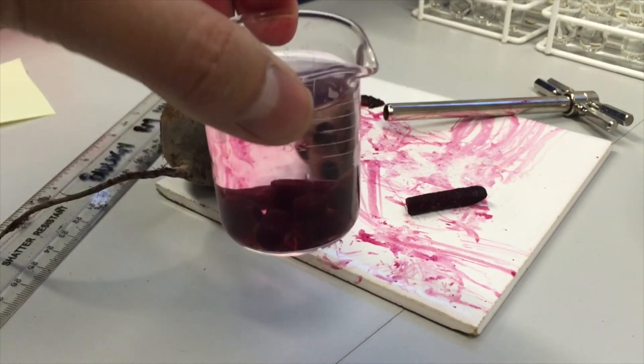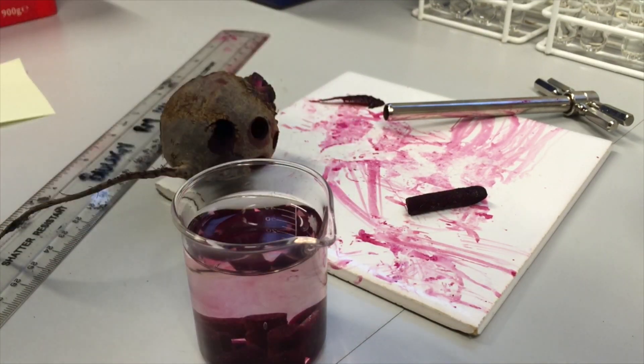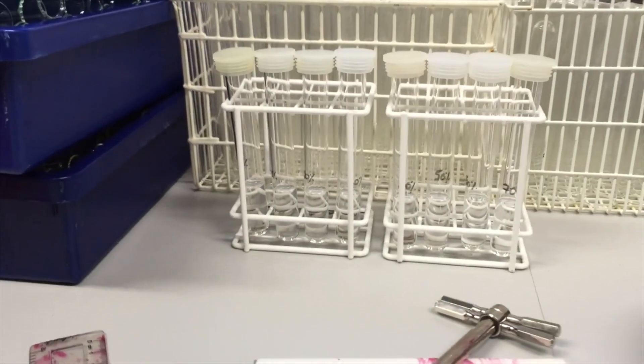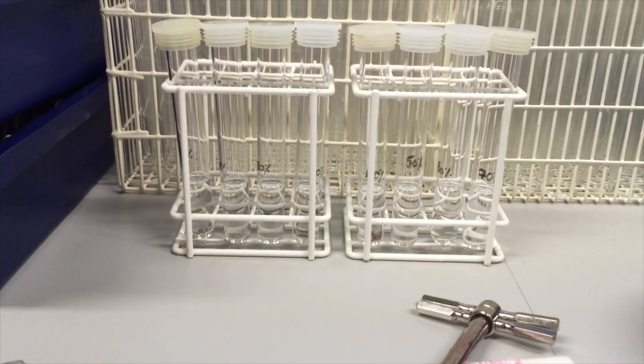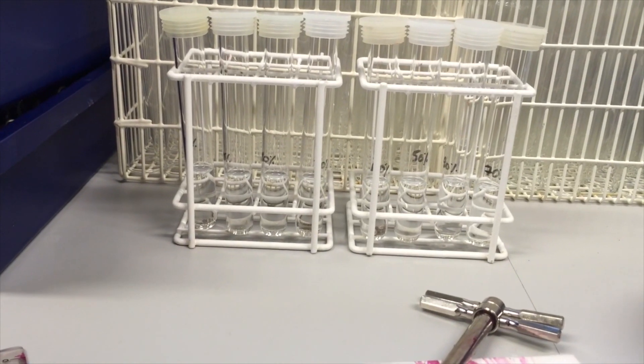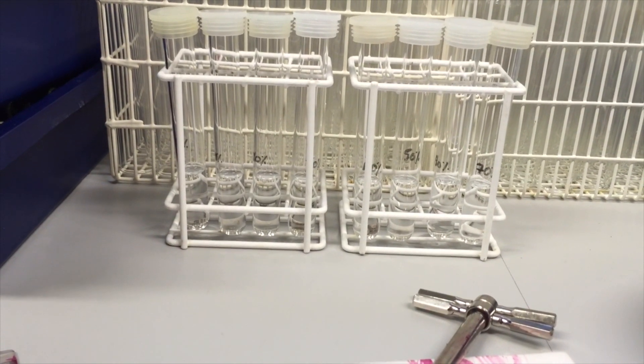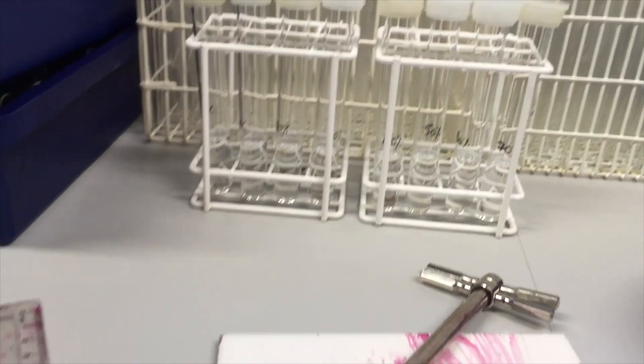What we're going to do is put these pieces in the test tubes that contain the different concentrations of alcohol, and we're going to look at the effect of that alcohol on how much dye is released from these sections.